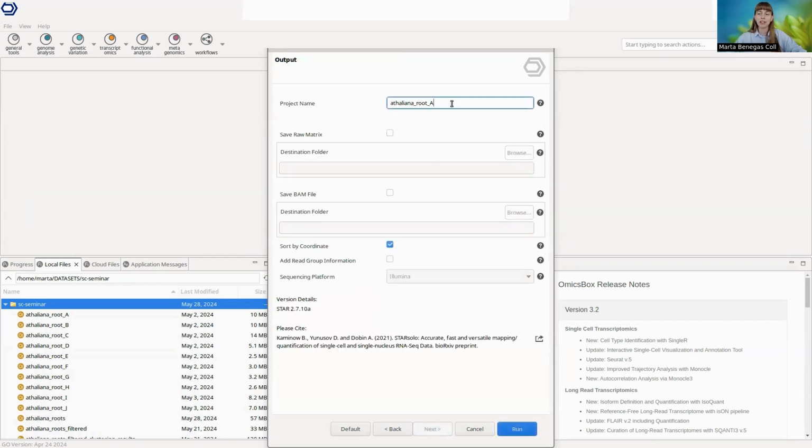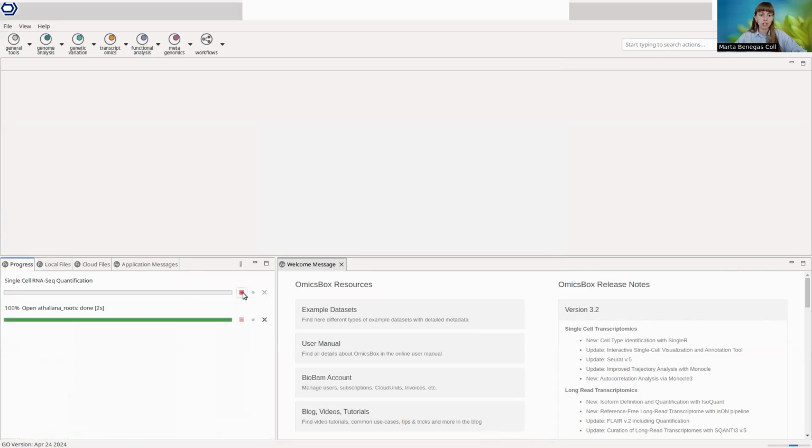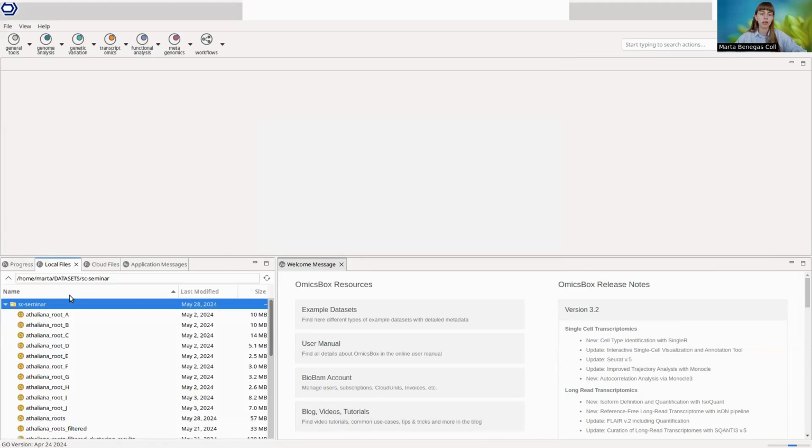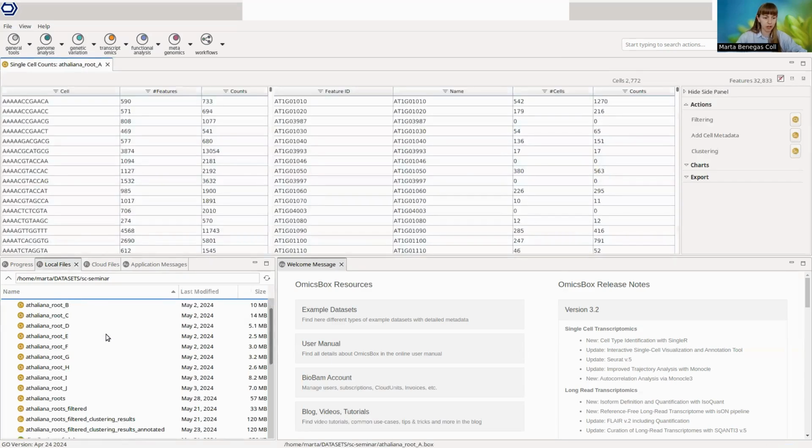Finally, we will give a name to our sample and we will click on run. This usually takes a little bit more than 1 hour to compute, but I already did this for you. Here we have the results.